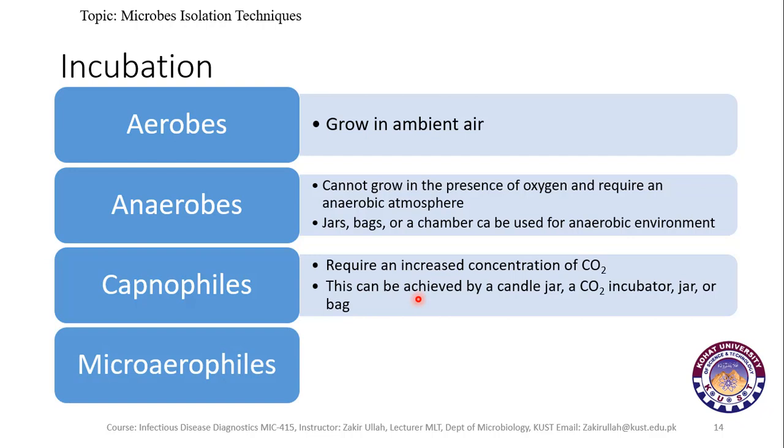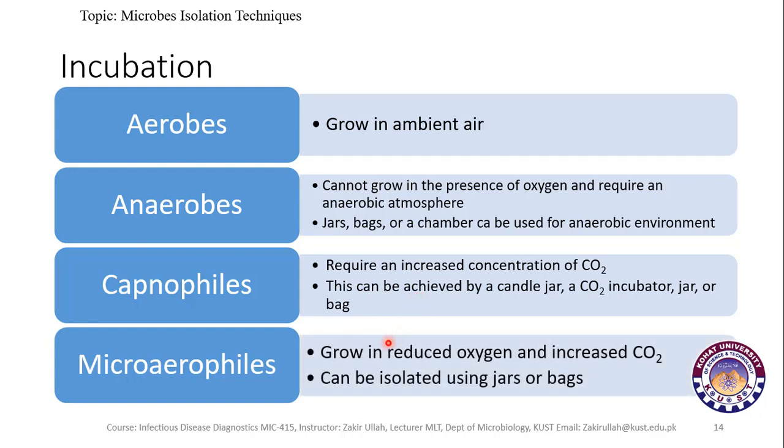The fourth type of microbes on the basis of gas requirement are called microaerophiles, and they grow in a reduced amount of oxygen and an increased amount of carbon dioxide. These are also isolated by using jars or bags and setting the environment according to their growth.